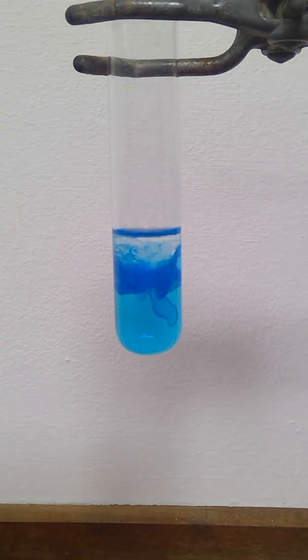What has happened here is that the copper ions in the copper sulfate solution have met the hydroxide ions which are present in the sodium hydroxide, and they have come together to form the insoluble solid copper 2 hydroxide. The sodium ions from the sodium hydroxide and the sulfate ions from the copper sulfate remain in the water, able to move freely around. They have not changed. They are sometimes called spectator ions.